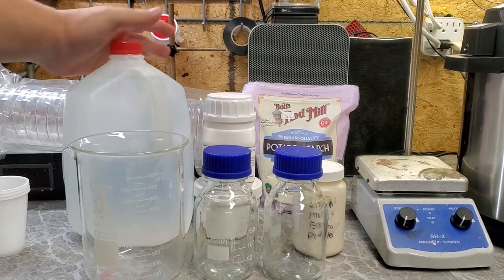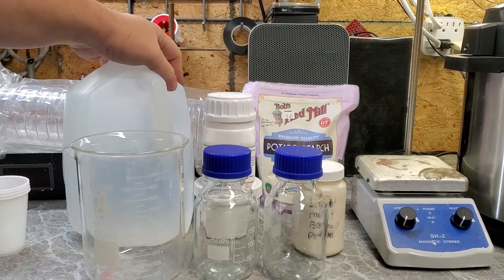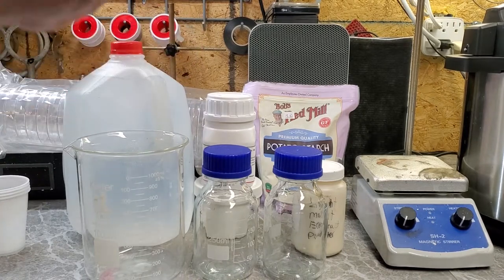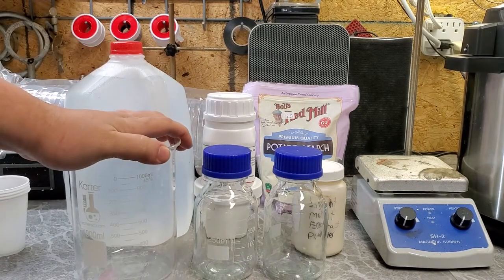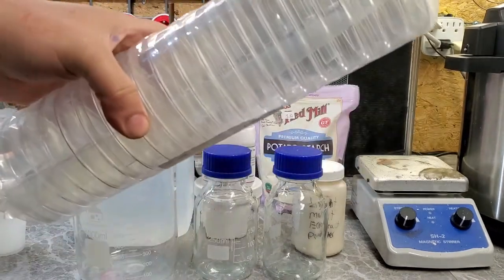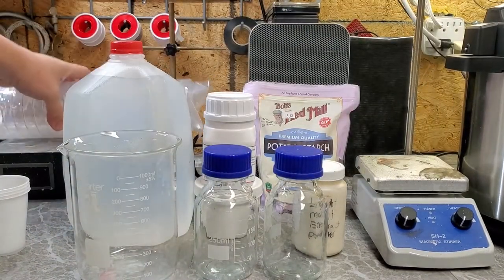I need petri dishes. Mushroom season is almost here in Pennsylvania. I've got about two weeks before they really start coming out, so I want to be kind of prepared. I'm going to make 20 — yeah, there are 20 of them in here — 20 of these three-compartment petri dishes.